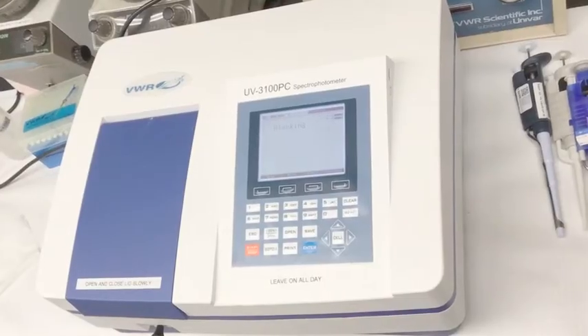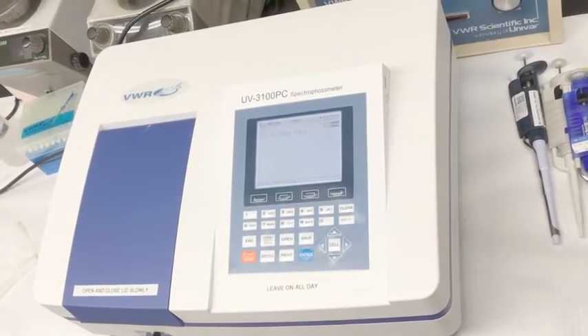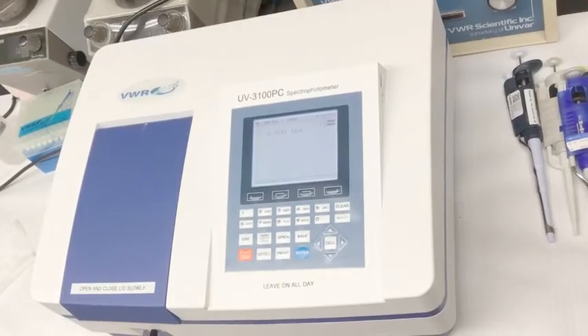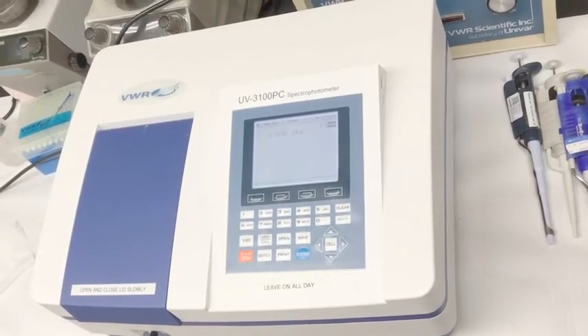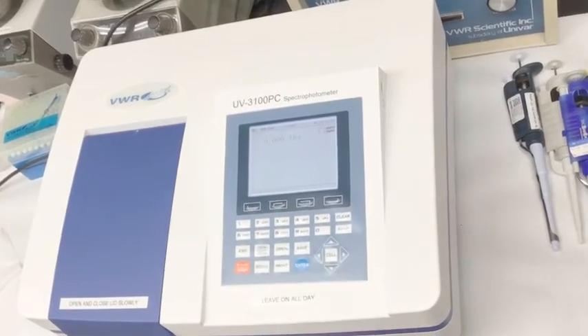Next, press the Go to Wavelength button. By using the keypad, enter the desired wavelength. In this example, we will change the wavelength to 410. Now hit Enter.